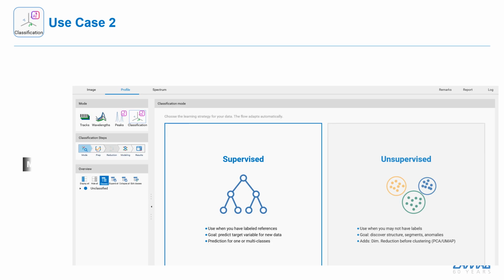So the logical steps in visionCATS are to first select the supervised mode, and since we work with a supervised mode, we need to assign the good high quality samples to a certain class. In other words, we have to create a class or a group that includes these samples. We can do this by clicking on the Edit Class option.